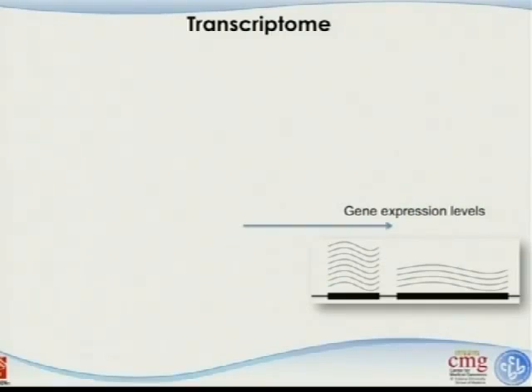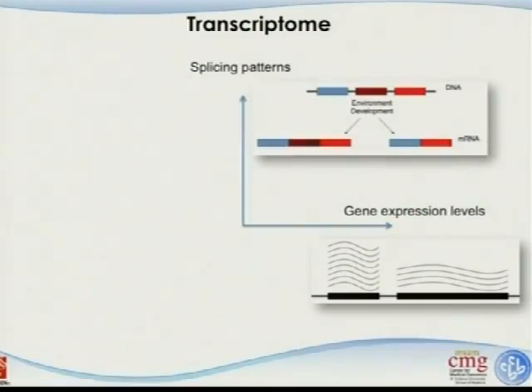However, transcriptome is really not one-dimensional. And the second dimension will be the splicing variations. So you can see that this is one gene, and there are 3 exons here. And the splicing occurs where the intronic regions will be spliced out. So in one biological condition, you can see that the middle exon has been kept in the final product, and in the other one, it has been spliced out. So this one gene eventually becomes two different isoforms, and whether we have the technology to measure that.